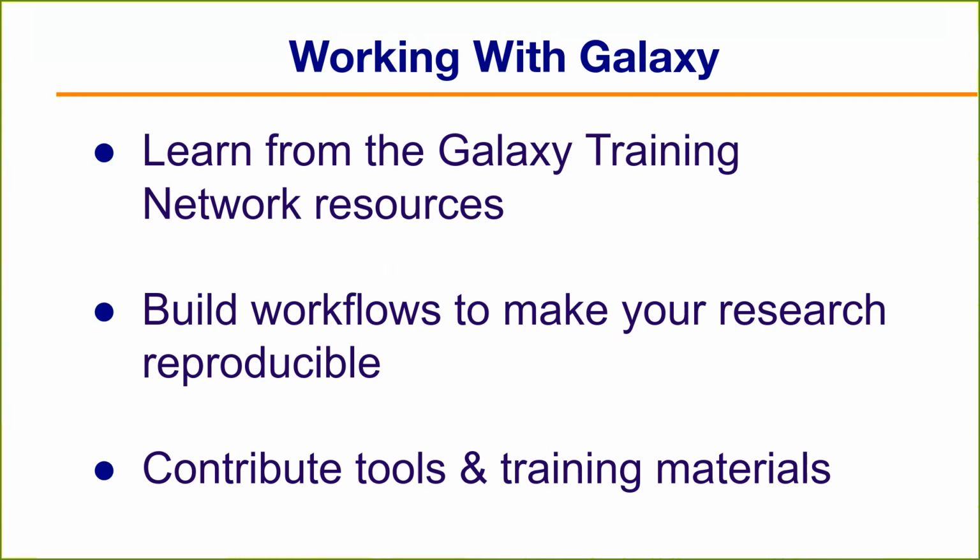Individual tools can be combined into workflows. Okay, so there's a workflow editor within Galaxy. It's a graphical workflow editor. And then instead of running one analysis and another analysis, you can run the entire workflow. And this is really great in terms of reproducible research, because when you're going back to analyzing things, you can say, okay, I did all of this with this workflow. So therefore, if I want to do it again, I just run the same workflow. It's not a manual process.